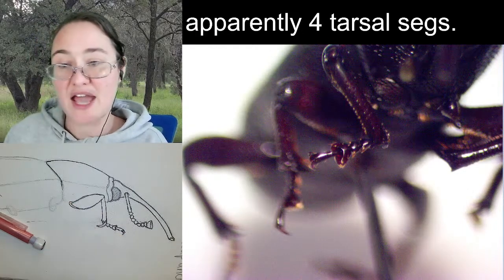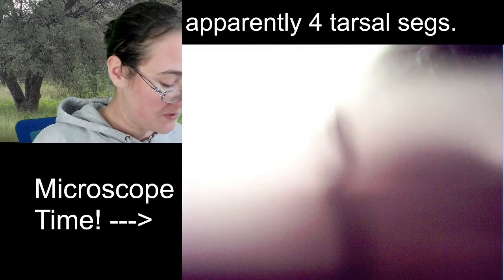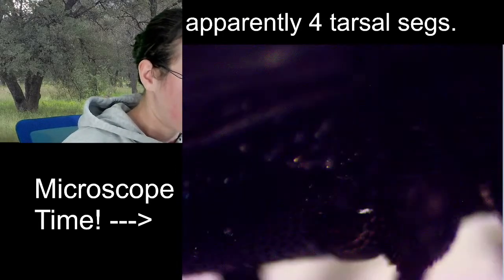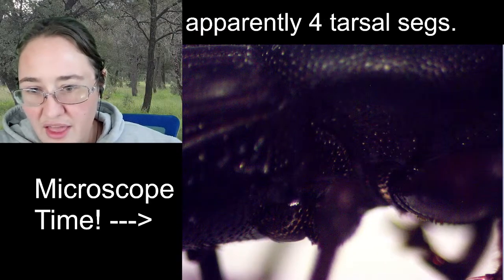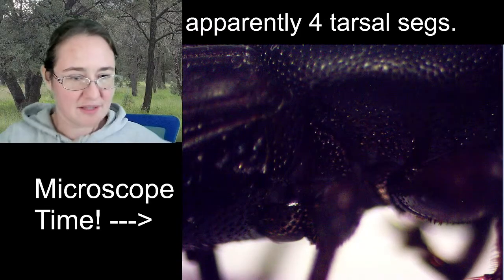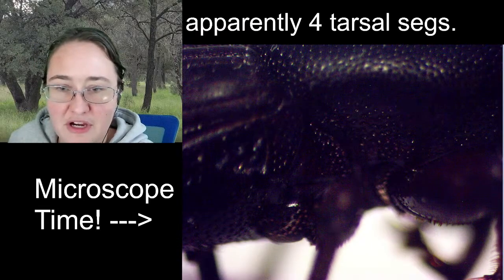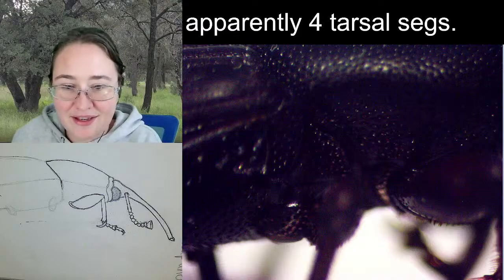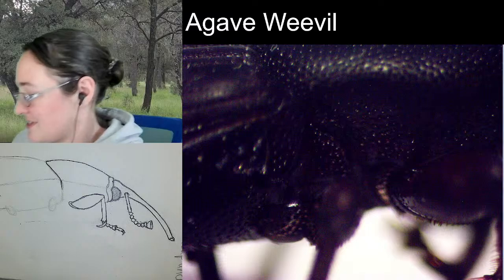I want to look at the side of this body here and finish that up, because I mentioned for a moment that there might be something weird, wacky happening there, and that's because it does not go straight down. The hind coxa gets in the way. So this is going to be the best that I can do from here. Whoops! Hey, that was cool. It actually undid. We're going to do the agave weevil here, so I don't have to keep changing it.